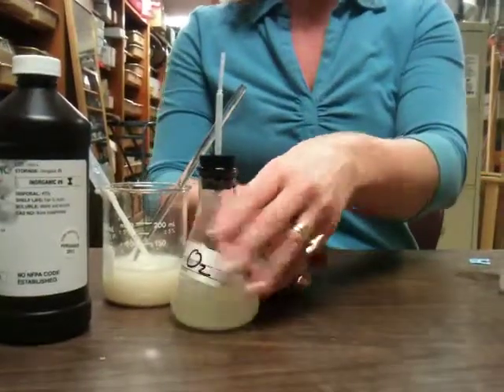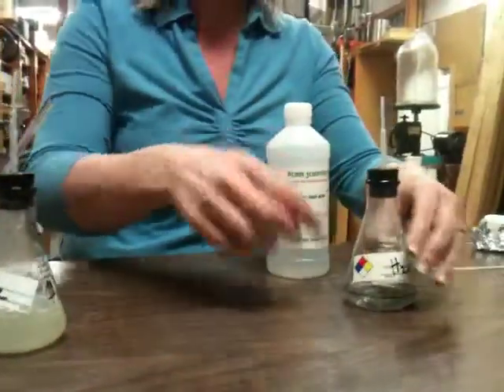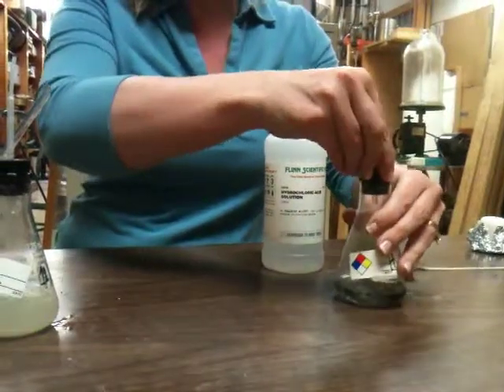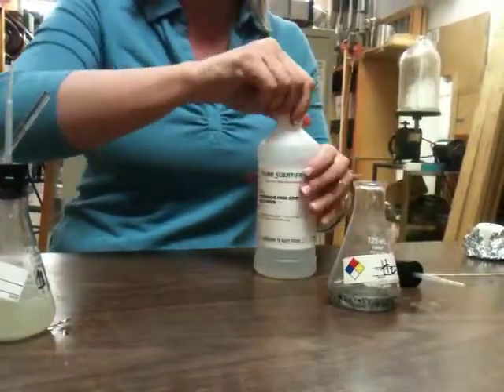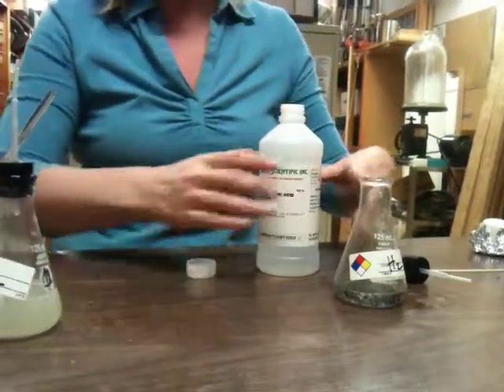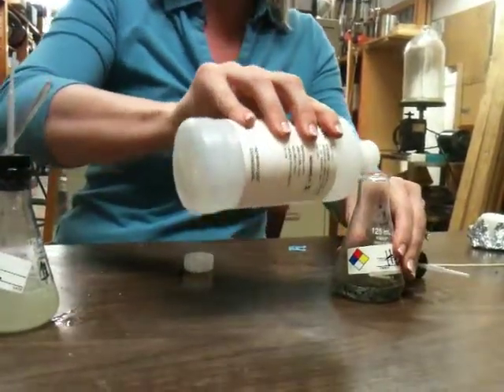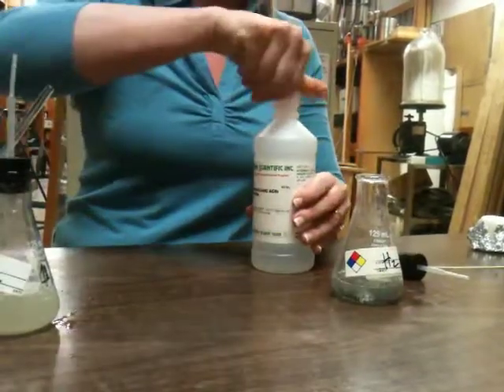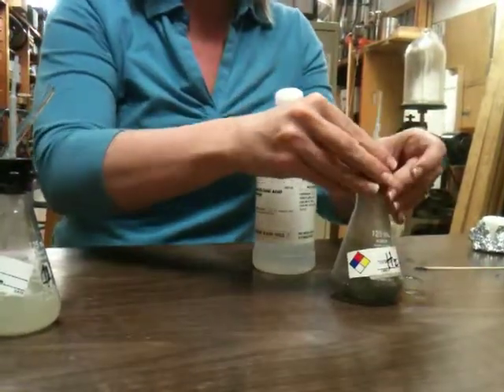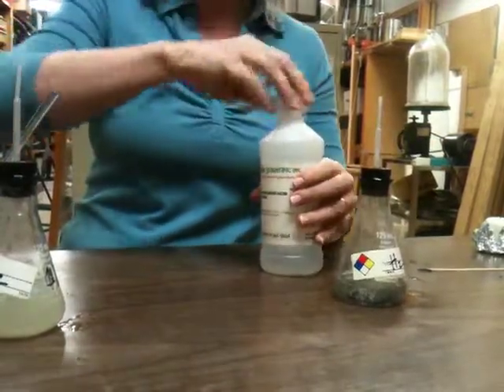So while that's going, we'll get this one set up. Remember, it already has the zinc in it. If you get yours and it doesn't have any, you can be the first person to add some in. And we're going to add a little bit of our acid. Exact amount doesn't matter. And we'll get this stopper on, and we'll let that build up.